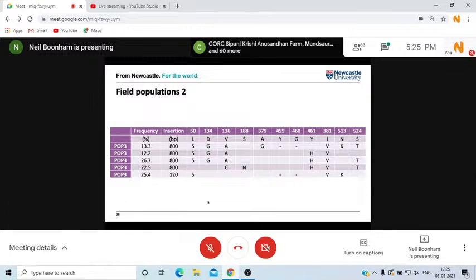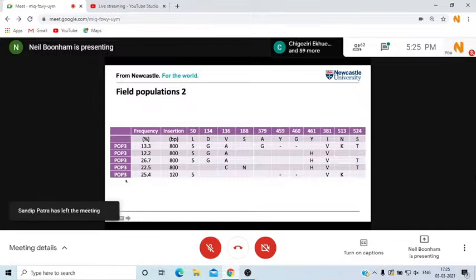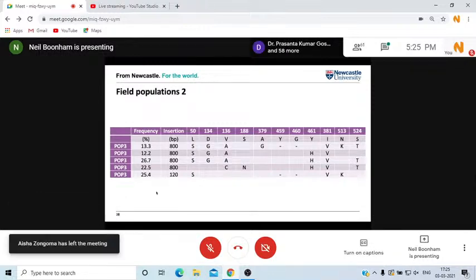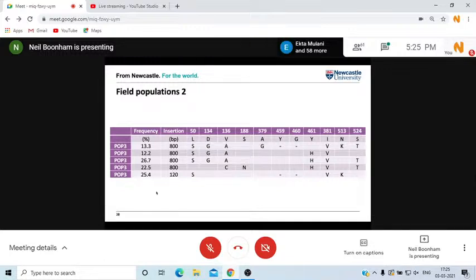The next population, this is again just an example, was a slightly more complex one. This time we saw five different isolates and at different proportions. Some of the isolates were rare and some were more common. I'm not going to bore you with loads more tables of the same looking types of results, but we just tested a range of different field populations and we can see complex and simple ones, and our precision seems to be around about the 5% mark. Isolates that are present within the population below that level, we're not really able to see very easily.